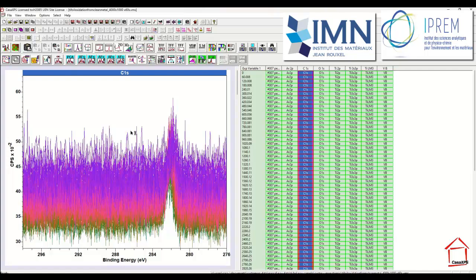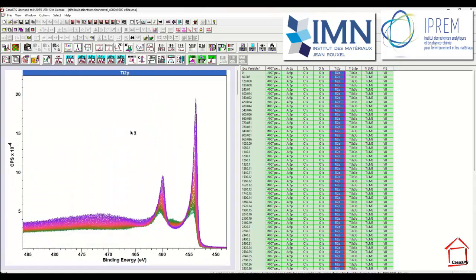And the idea of the experiment is to observe changes occur within the titanium 2p as a result of the oxidation sequence. So we can see that the surface is oxidized with time. You can see the color coding that applies to these VAMAS blocks indicates that we started off with the metal and it progressively oxidizes to produce a shape in the data which is very different from the original metal spectrum.